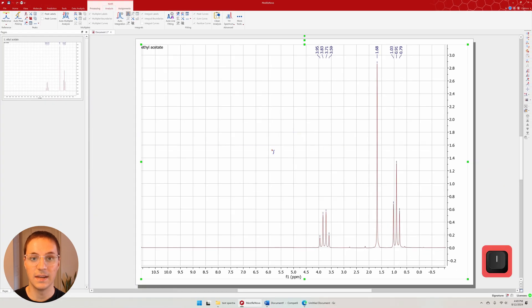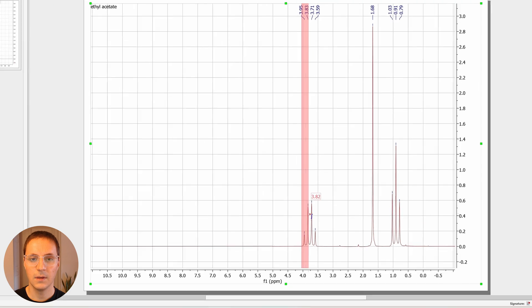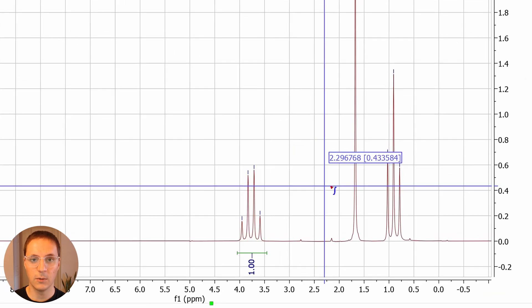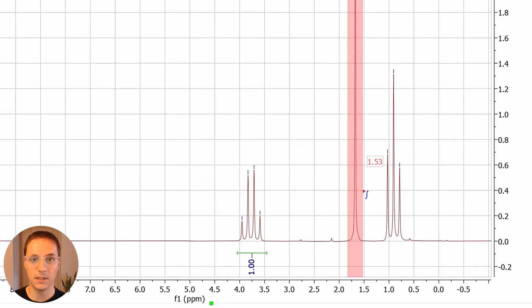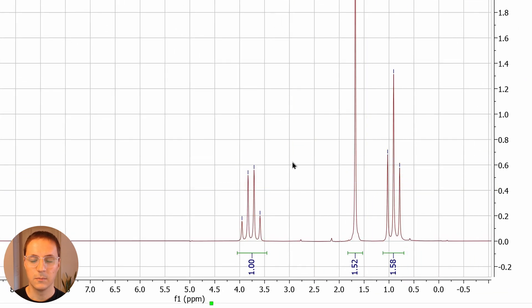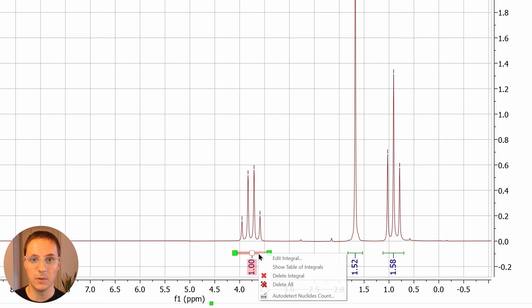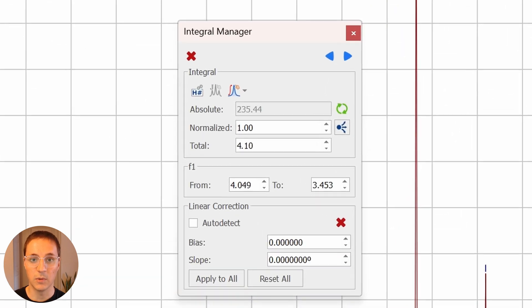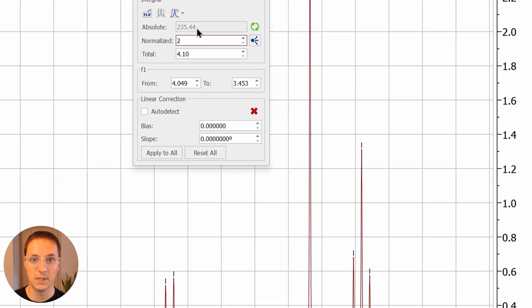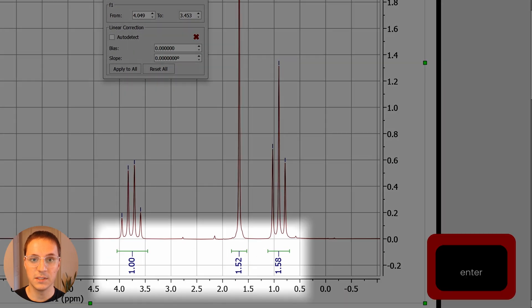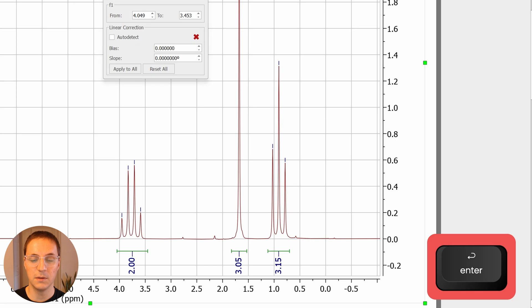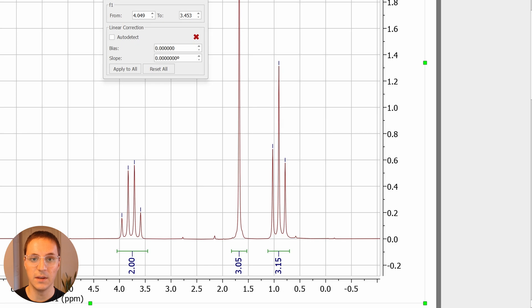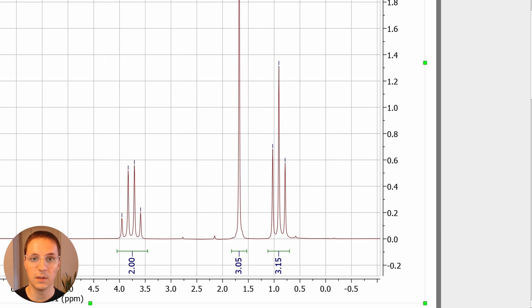Press I to enter the integrate function. Click and drag horizontally to select which regions to integrate. Right click on the integral label and select edit integral. Under the normalized field, you can enter the number of protons you believe this signal represents. Pressing enter will automatically recalculate the other integrals relative to that one.